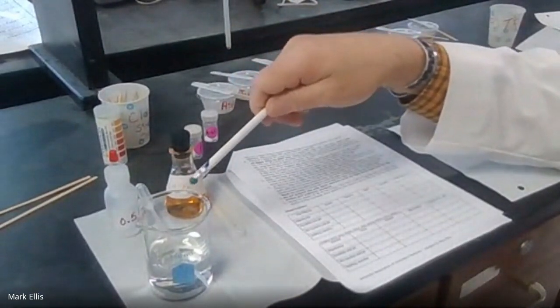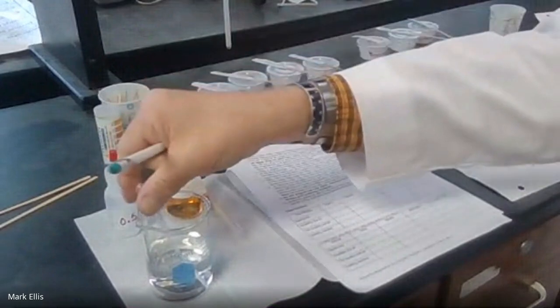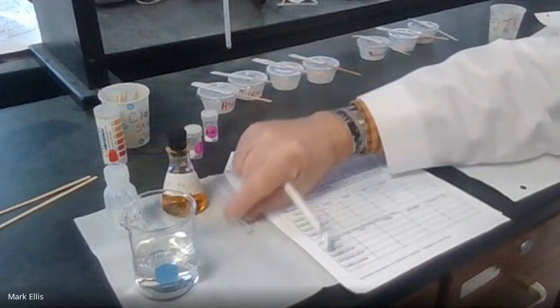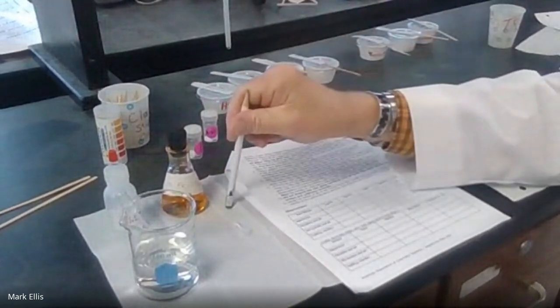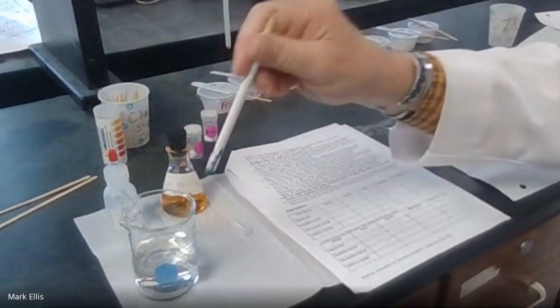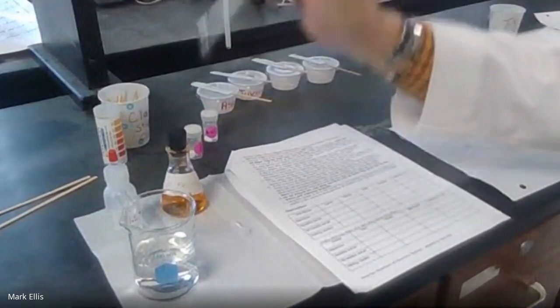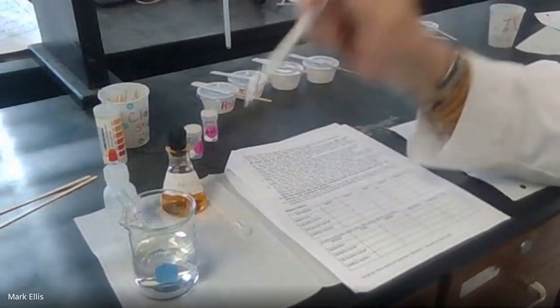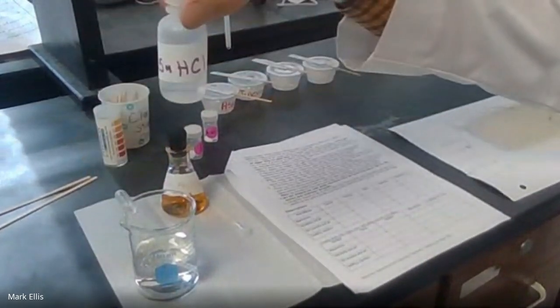Also, I have my station set up nice and neat. Here is the distilled water with the eyedropper in it. Keep that eyedropper in there. Here's the iron 3 nitrate solution and the eyedropper that goes for that. Do not cross-contaminate. Do not put the iron 3 nitrate dropper in with the water or use the water dropper to get the iron 3 nitrate. You have to pay attention to what you're doing. This is just a little dropper of 0.5 hydrochloric acid.